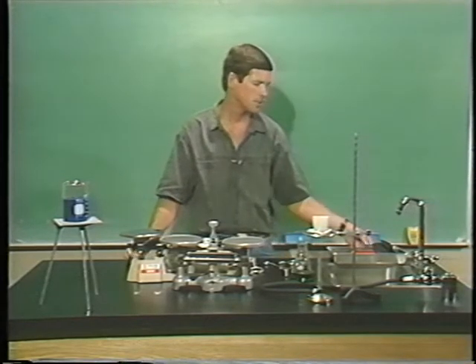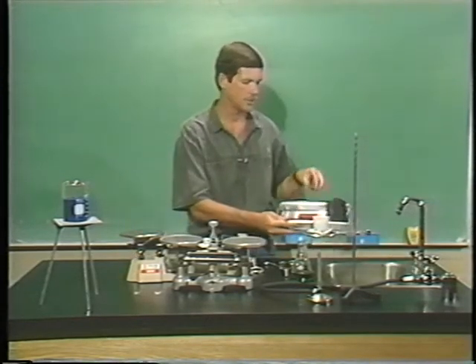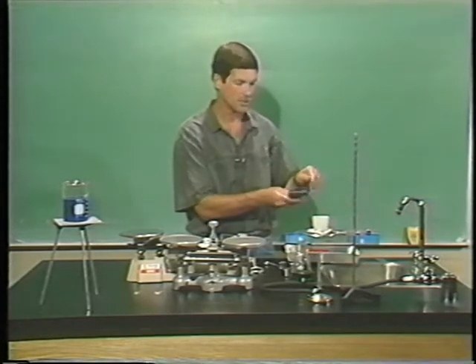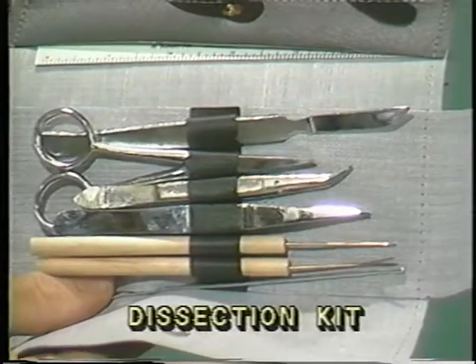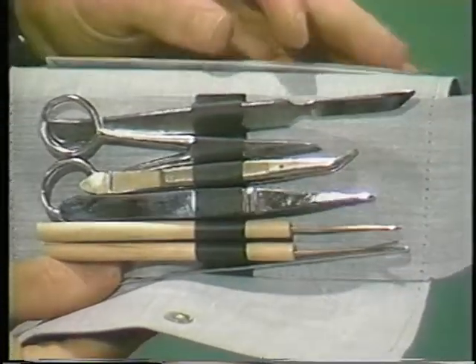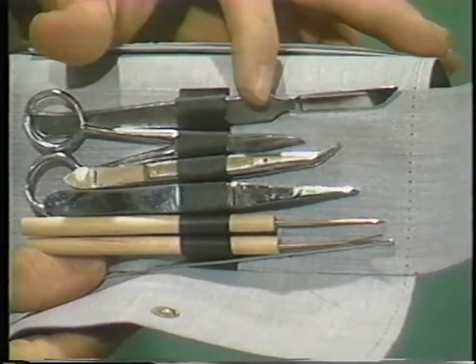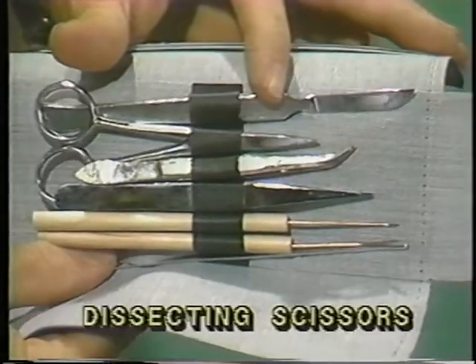If you're doing any dissections, you've probably seen these before, dissection pans. And inside this dissection pan, we have a dissection kit. Let's take a look at what we have here. This top item is called a scalpel, used for cutting things. Then we have a pair of scissors. These are special scissors called dissecting scissors.